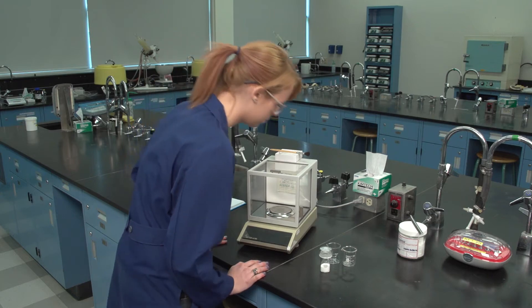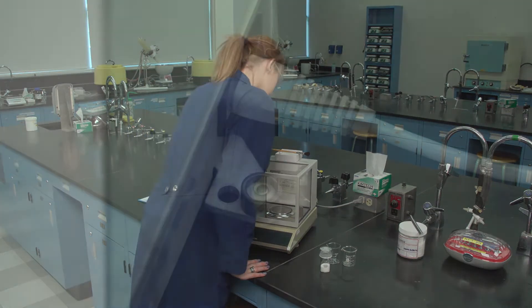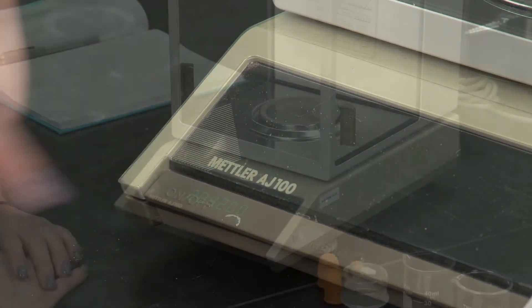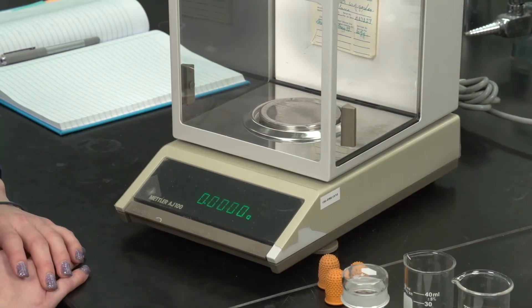Prior to use, ensure that the balance is both clean and level. Turn on the balance. Press the tare bar and wait until a stable zero reading is obtained.